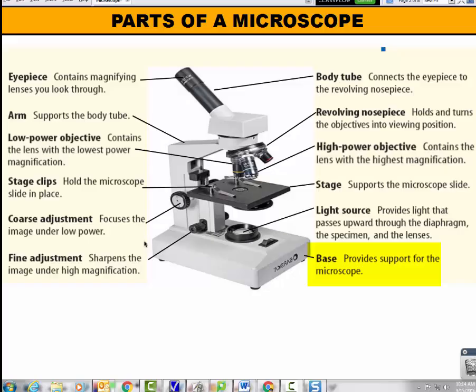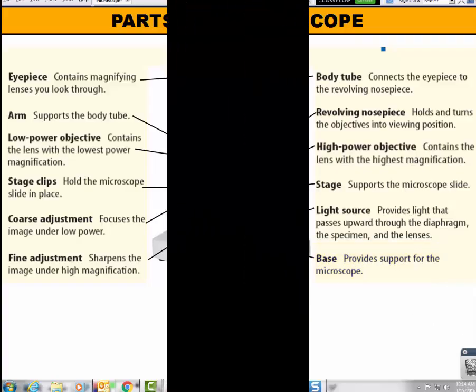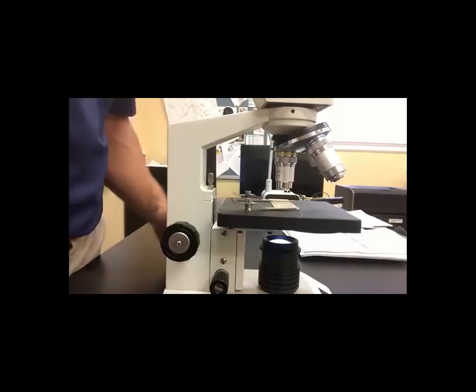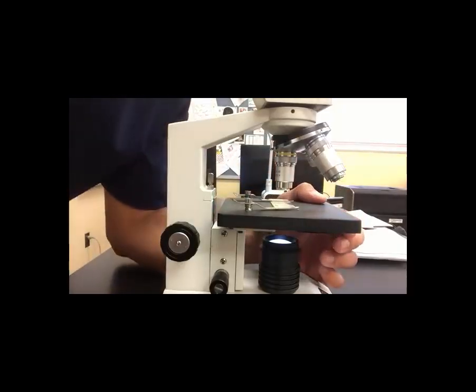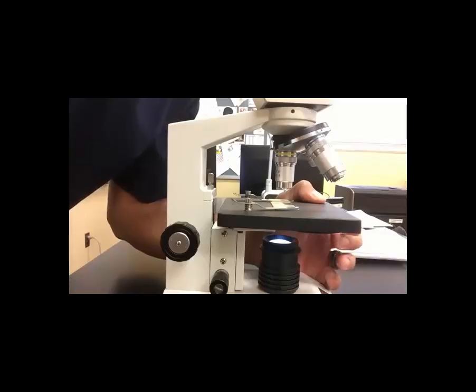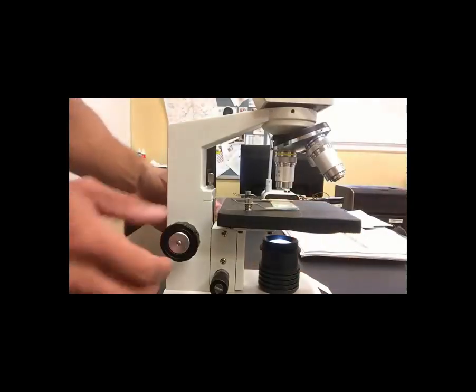Let's take a look at how we go about focusing the microscope. To focus in on an object, the first thing we'll do is secure the slide to the stage with the stage clips. Then we'll adjust the diaphragm to allow the proper amount of light to pass through the stage. This allows us to see the specimen. Four or five is usually the best.